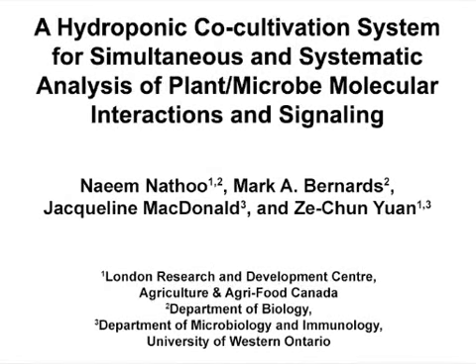The overall goal of this system is to study the reciprocal signaling, interaction, and responses between plant and microbe partners, or plant responses to chemicals or abiotic factors in a simple experimental setup that closely mimics the natural environment. This video shows co-cultivation of plants with Agrobacterium tumefaciens bacterium.